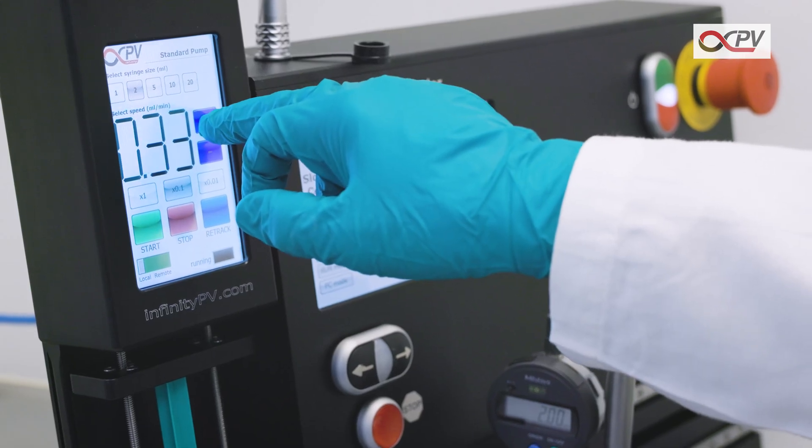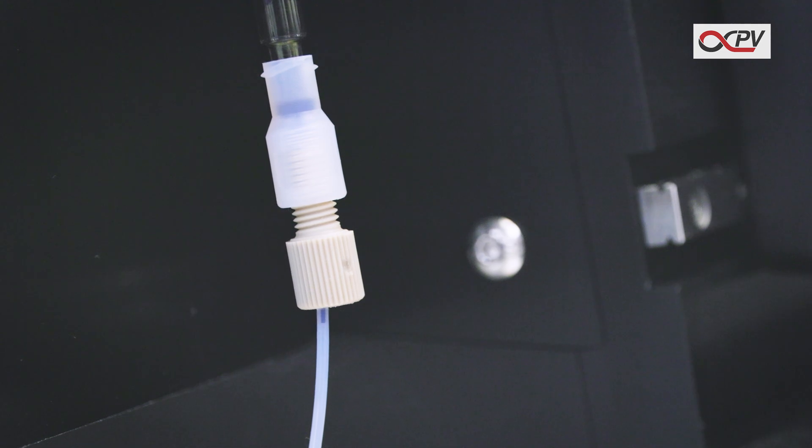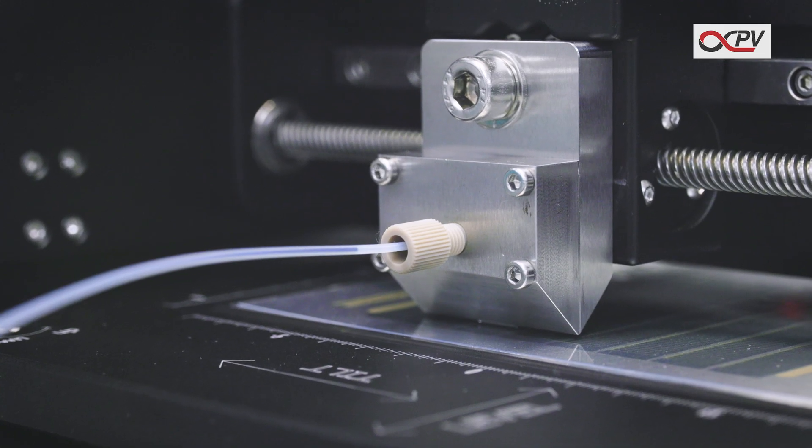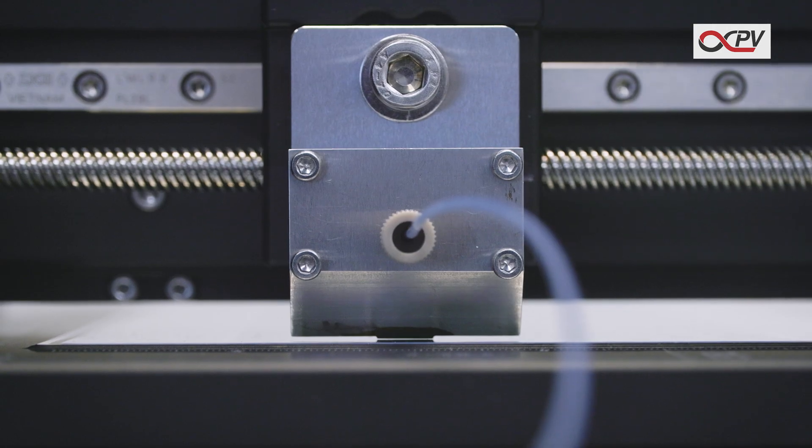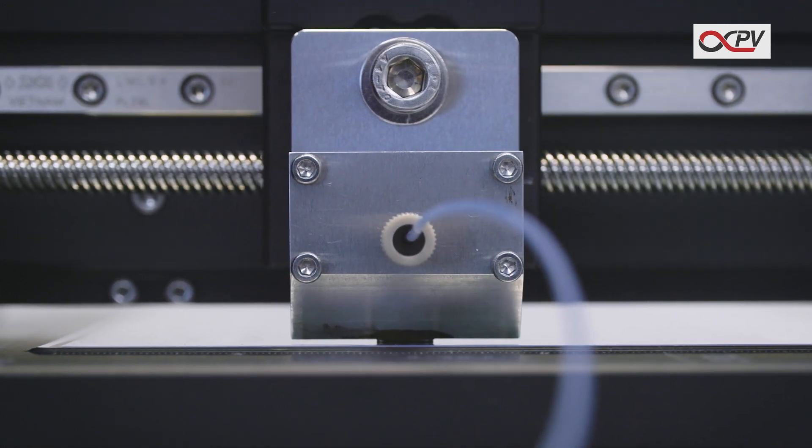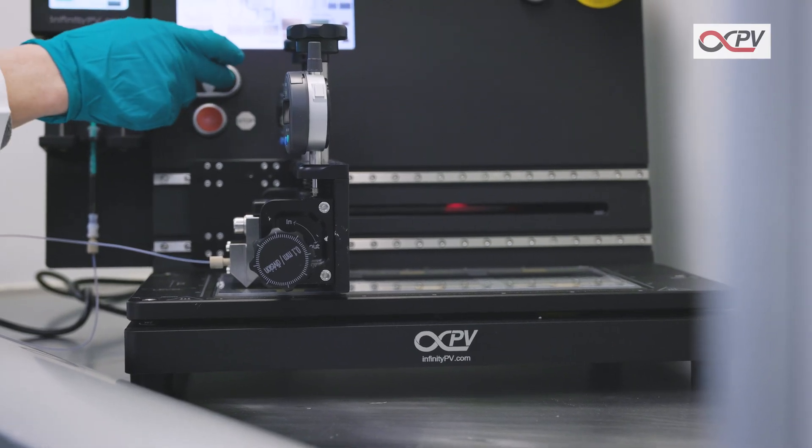Set the ink flow and start the pump. The ink will now flow from the syringe to the Slot Dye Head. Wait for the creation of the meniscus. Press the forward button to start coating.